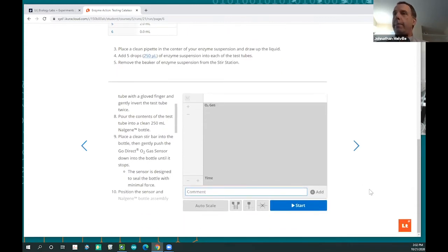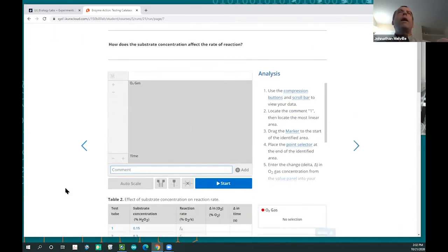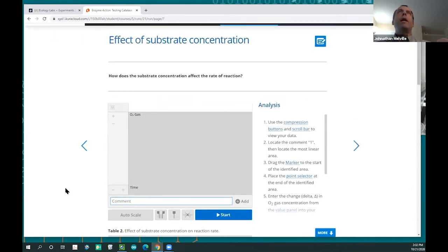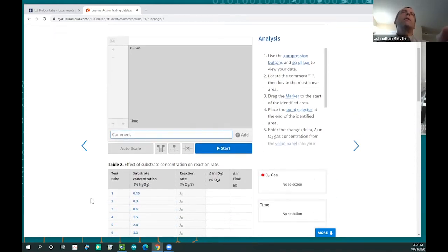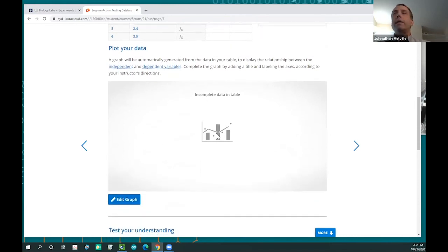There's a way to get the sample data in as well. Same thing, if I were just to hit Shift Start, sample data would come across. And once again, there is a whole other aspect of this lab that looks at the actual data that you could analyze. And once again, it would also plot the data so you could do a plot.